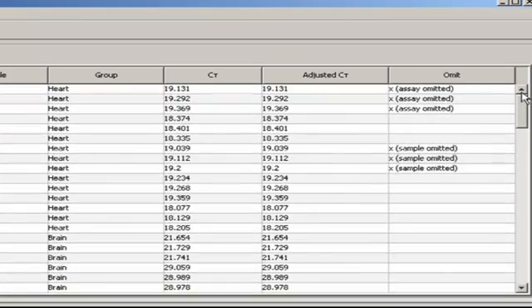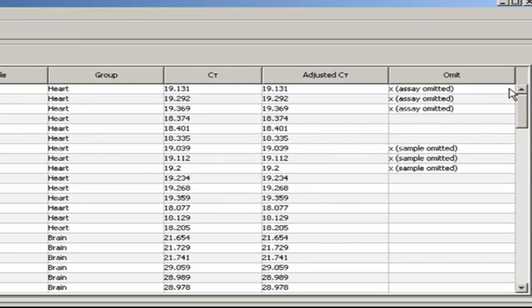Now, provided we told it to do so in the analysis settings section, and that we ran three or more replicates for each sample, the first thing DataAssist does is to eliminate any technical replicates that don't meet the precision standards of a modified Grubbs test.